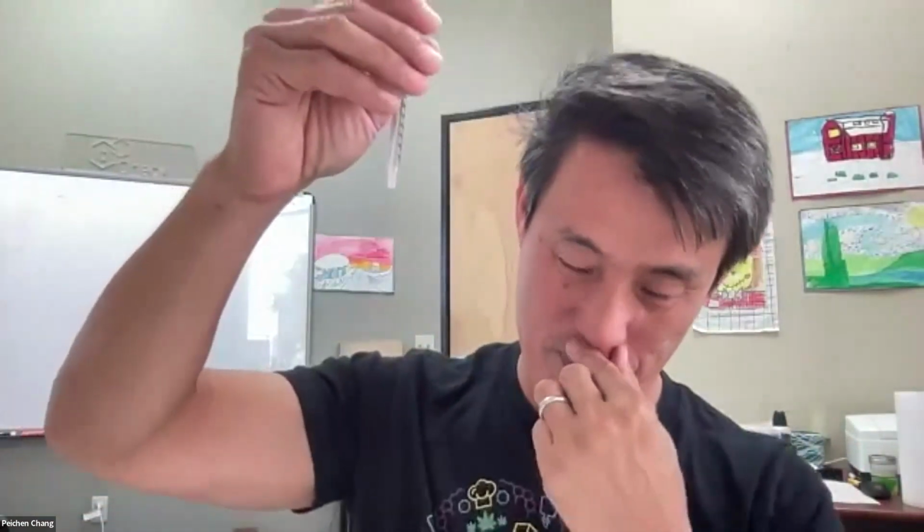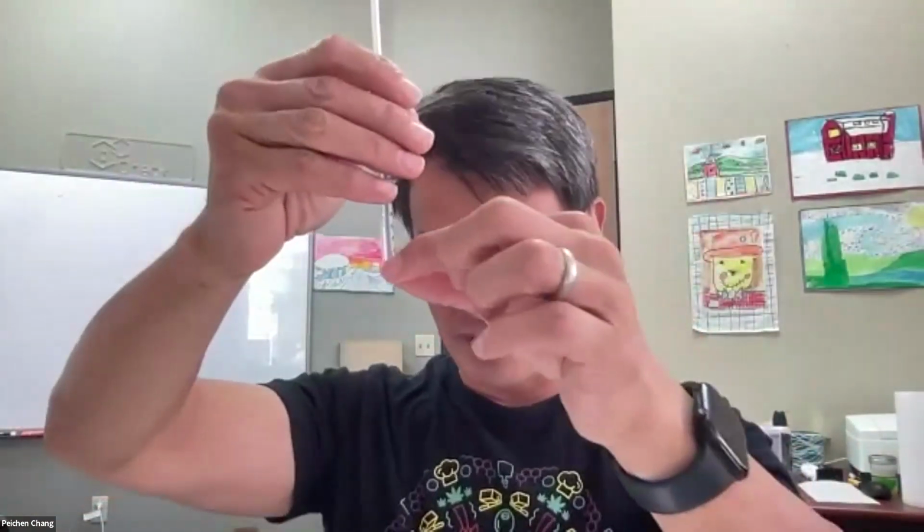Then withdraw some fluid, and then put the filter on. I always hold the filter bit and then start squeezing the oil through, because there were a few times where I didn't do that and the filter popped off.